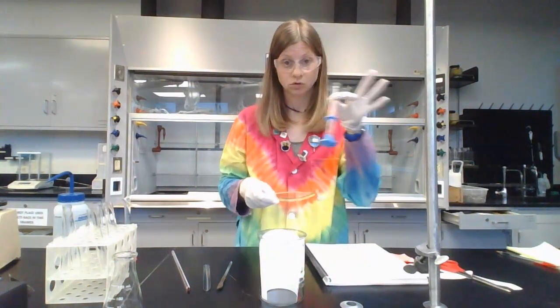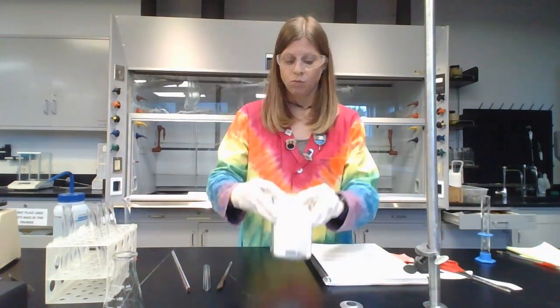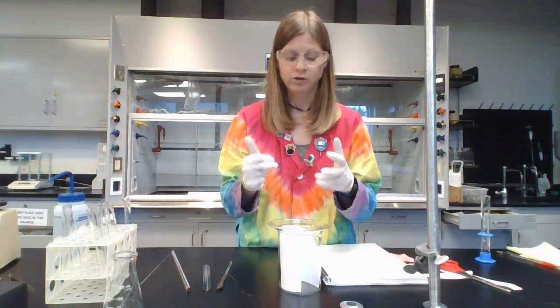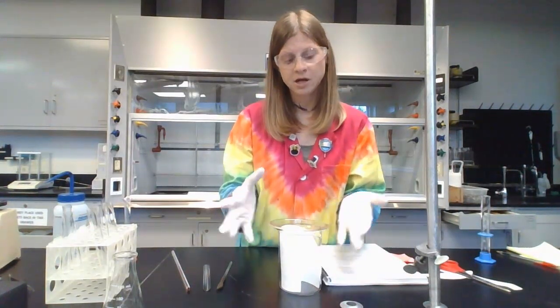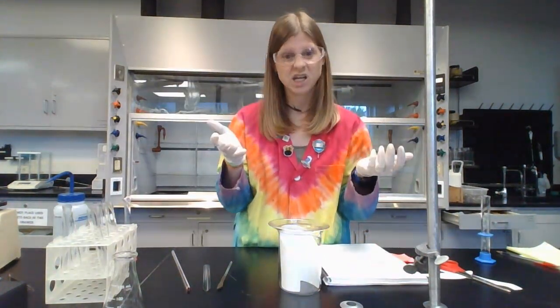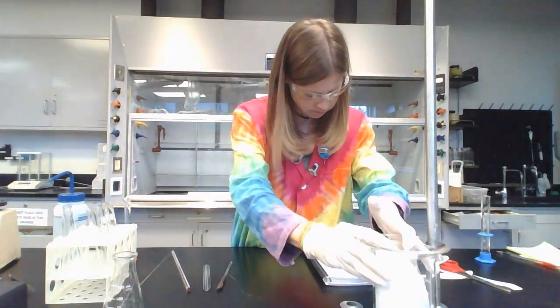into here, and then you're going to want to swirl it around. We want to get that filter paper completely wet, but no matter how well you swirl, it's not going to get it all the way wet. So what needs to happen is it just needs to sit, and so the liquid can wick up the top. So write your initials on it and make sure it's under some sort of fume hood or snorkel, because it's going to be stinky, like really strong vinegar, and just let it sit. Okay, so that's going to be sitting.